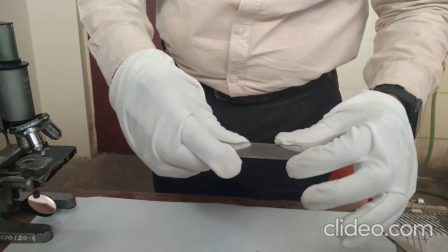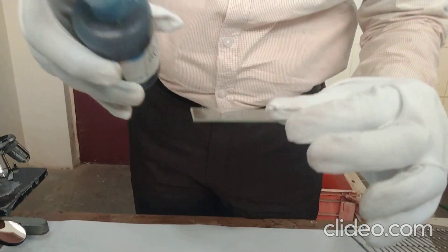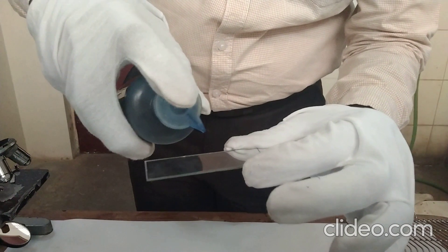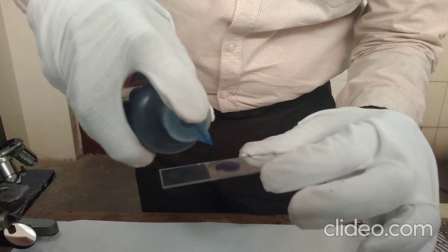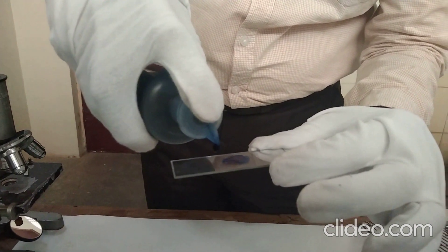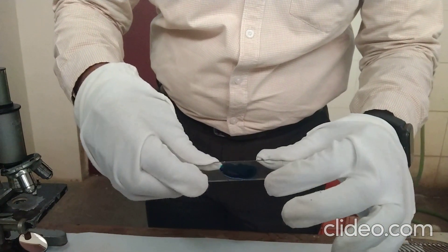Once it gets dried, put methylene blue as an indicator — just two drops of methylene blue. Mix this indicator properly onto the glass slide.